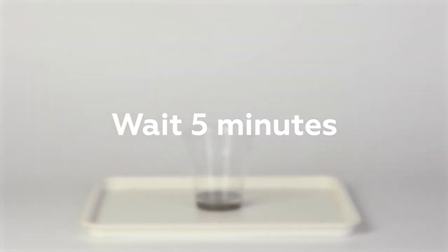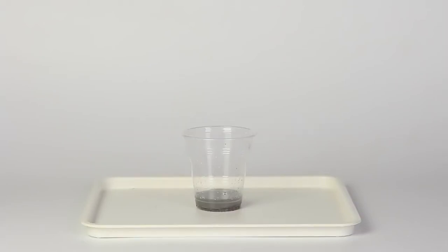The iron powder will react with the citric acid, yielding ferrous citrate and hydrogen, which is released in the form of bubbles.